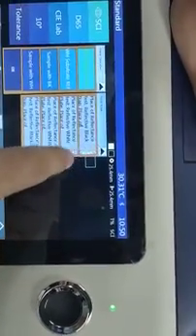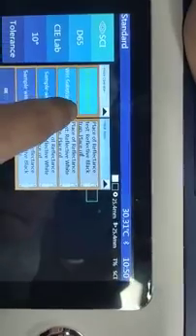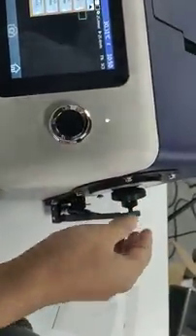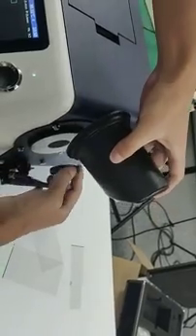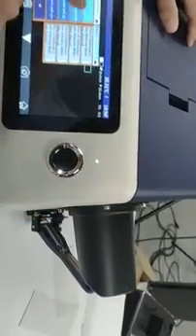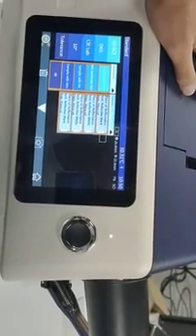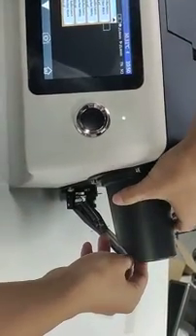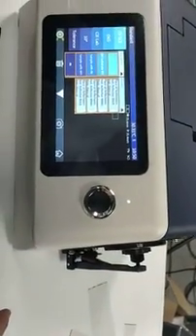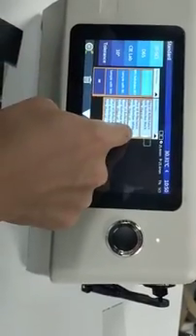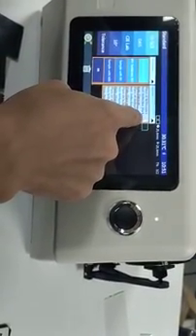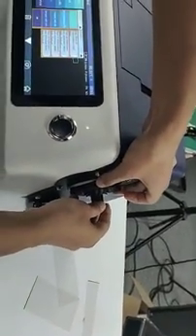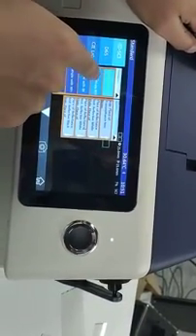To measure haze is kind of complex. First, black substrate reference, we put the black cavity at the reflectance measurement position, and touch here, and then second white substrate reference. We put a whiteboard here, and touch the second option, the second menu.